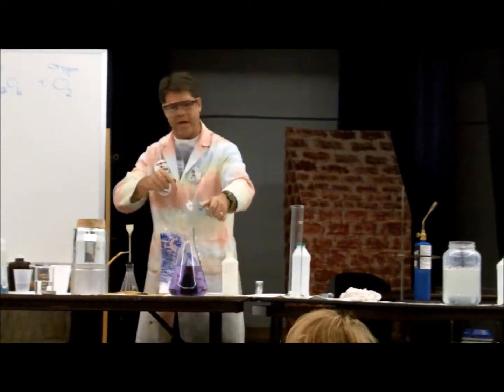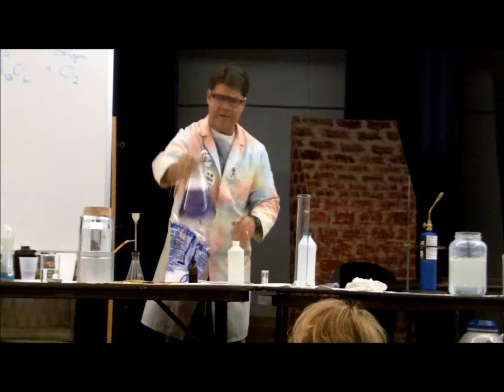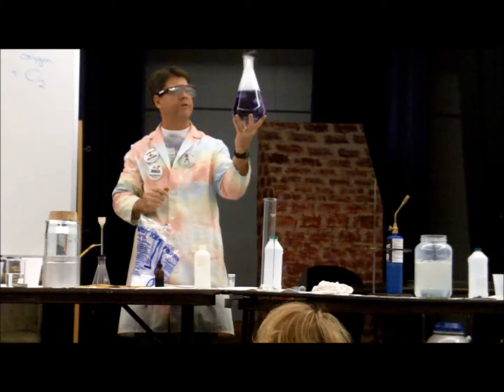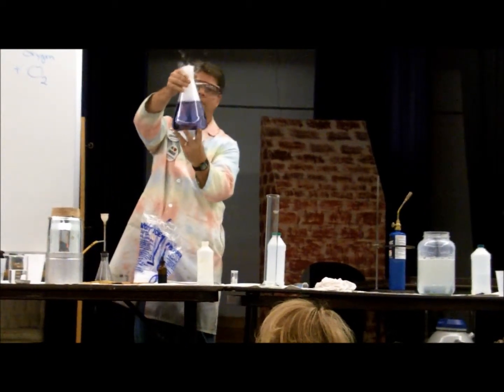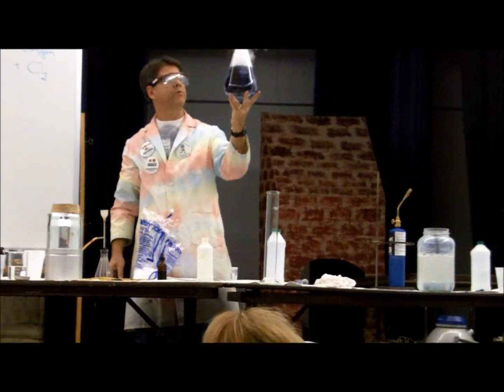All right? So now when I add this to my solution, not only is the carbon dioxide dissolving, but it's actually changing some of the chemical makeup of this solution. Okay? We are now going from a base type of solution to an acidic. And I believe we just hit green or blue, right?